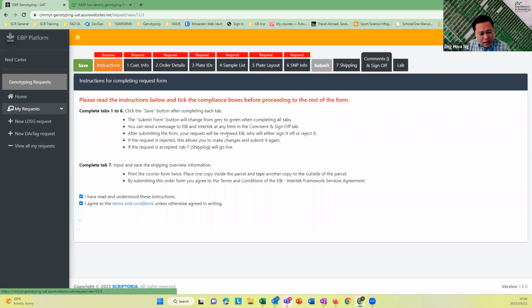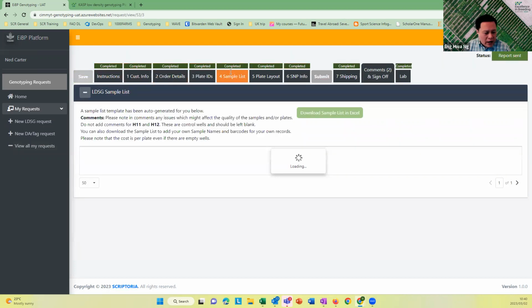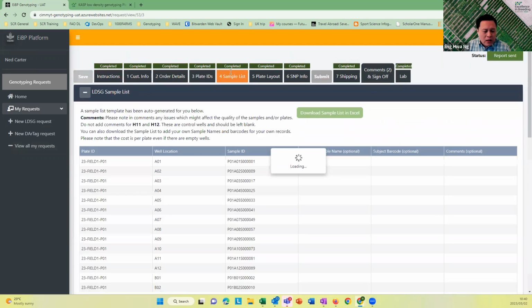We are handling slightly different types of information here because we have invoicing information and all that. But we certainly do not want users to have double the work, just because each system handles a fraction of the work, and we need all information together in order to submit the job. So we'll likely in step 1, 2, or 3, somewhere there, build a connecting piece where we can port over information from EBS.